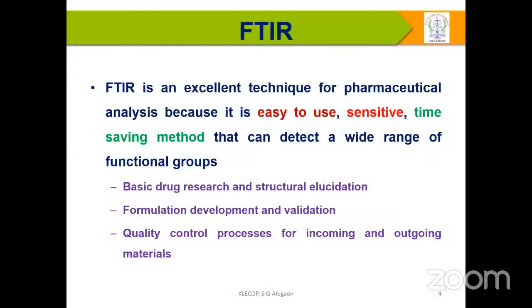Another reason why I'm going to study this is because FTIR is very important in basic drug research. FTIR is a very important tool for basic drug research and structural elucidation, formulation development and validation technology. And the third one, the most important aspect, is the quality control process for incoming and outgoing material.